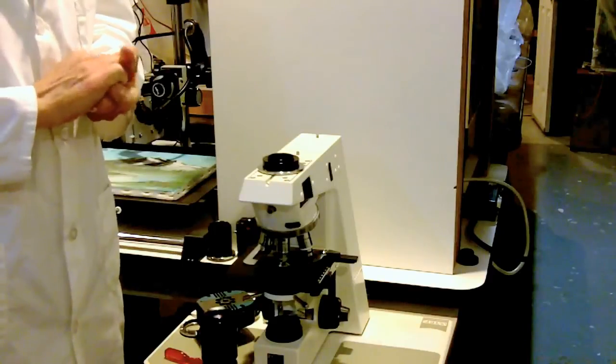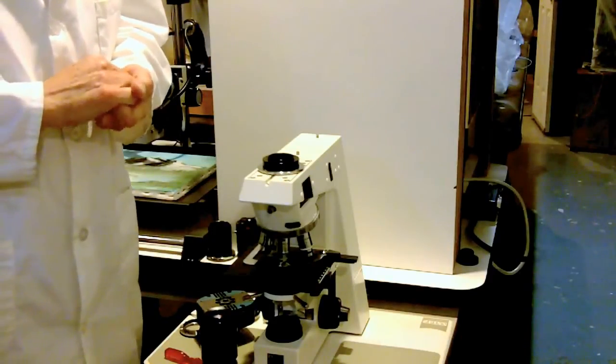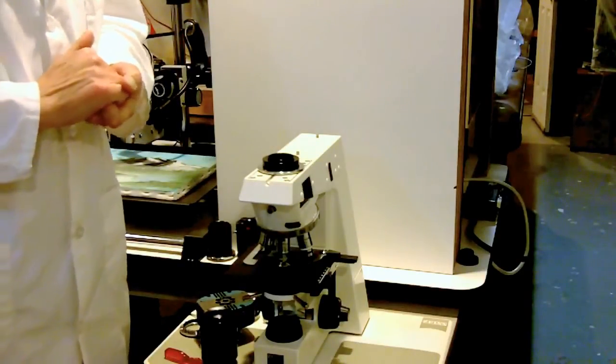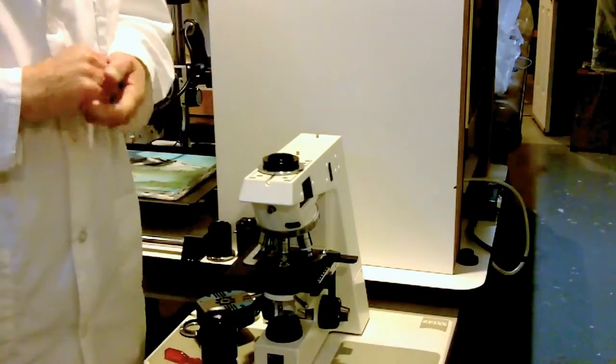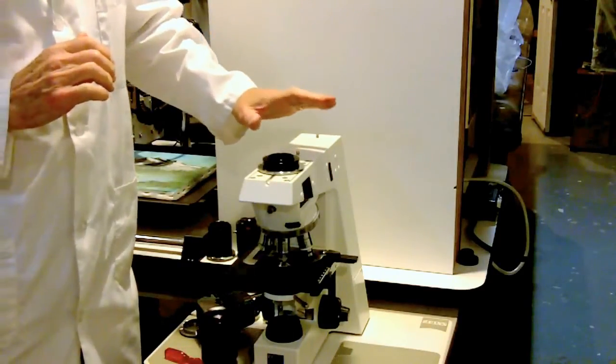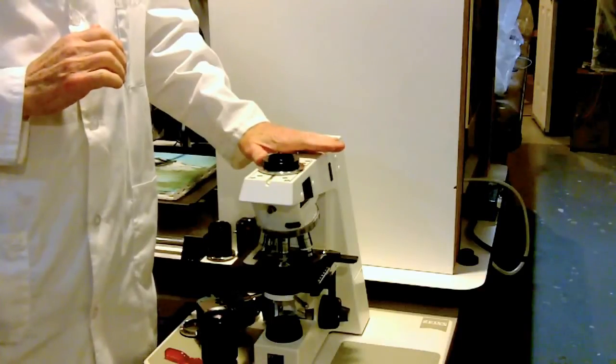People put microscopes aside because usually the lamp is broken, something's frozen on the mechanical stage, someone stole all the objectives. There's a variety of reasons, but the main thing is we want to bring these old microscope stands back to life.